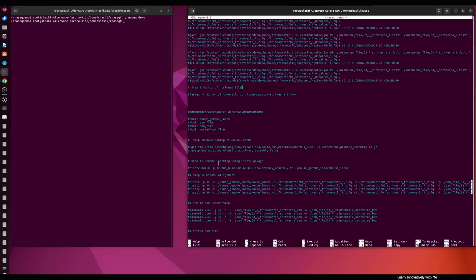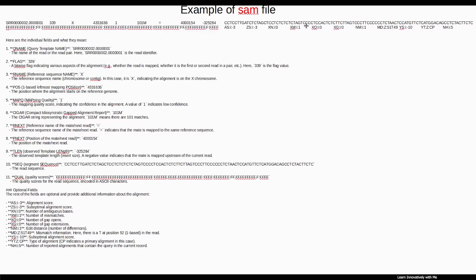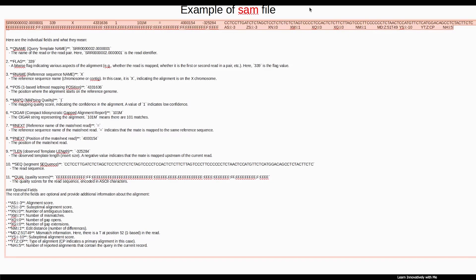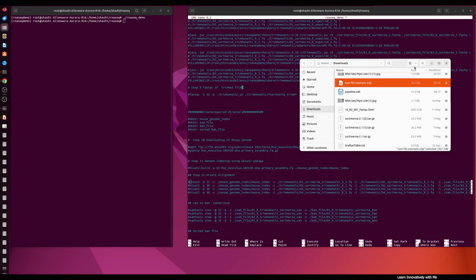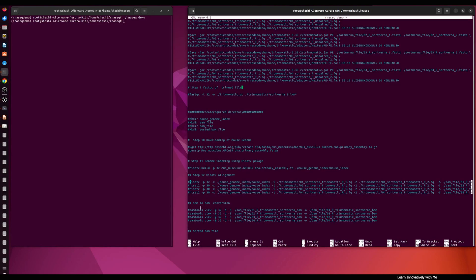Before conversion I want to show you some information about the SAM file. Using the head or tail command you can inspect the SAM file. It contains information such as the read ID for read 1 and read 2, the FLAG, the reference sequence — for example X indicating X chromosome mapping — mapping quality, and all other alignment fields. These files are very large, which is why we need the BAM file, which is the binary compressed form of the SAM file.